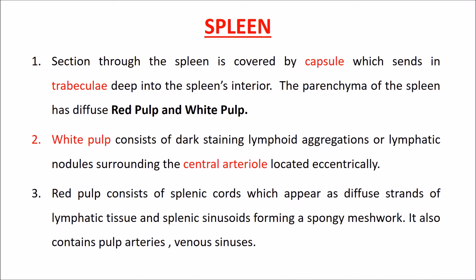Red pulp consists of splenic cords, which appear as diffuse strands of lymphatic tissue, and splenic sinusoids forming a spongy network. It also contains pulp arteries and venous sinuses.